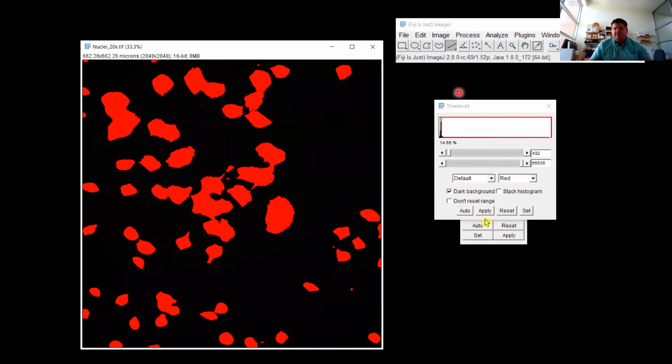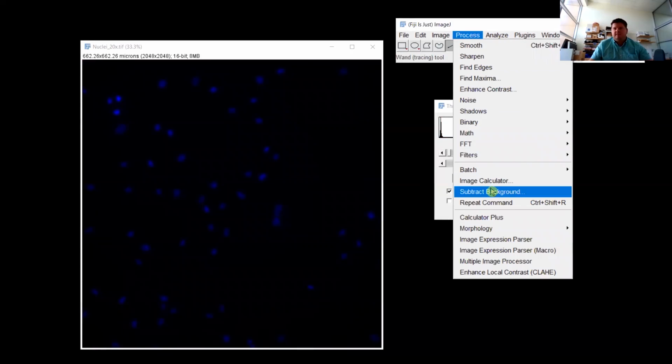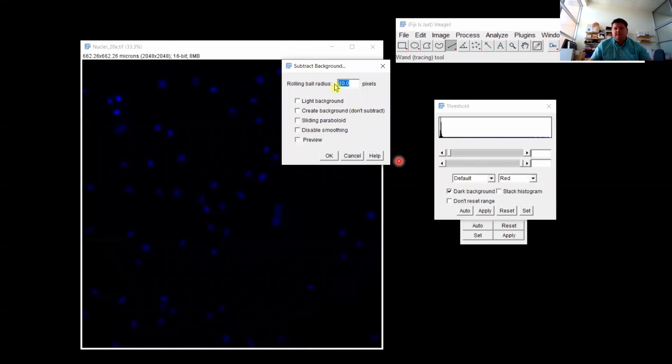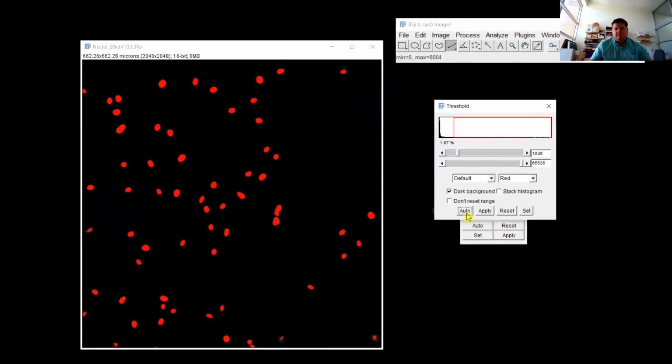I must have to do a background subtraction as well. That's better. So has everyone managed to do that? There's no questions coming up, no one's asking. We'll move on, shall we?